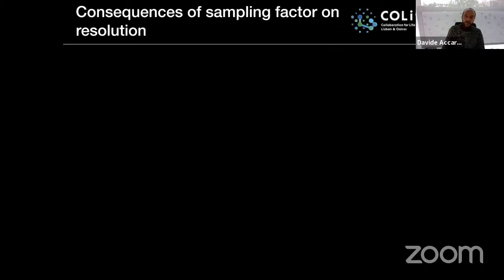So now that I gave you this teaser about resolution, I will tell you about the sampling principle. Let's consider two points, two a-dimensional sources of light in our specimen that are at a distance d, our minimum resolvable distance. The objective collects information that allows us to separate, to resolve these two objects. So we will see them as two separate objects, okay?